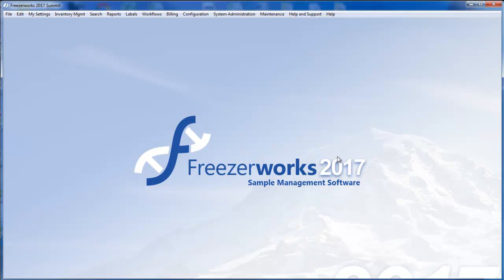Today we are going to go over configuring tests, which has received a pretty significant change. In previous versions, you could create quantitative tests and qualitative tests, but these were always separate. Now, there are just tests, where you can include as many quantitative and qualitative metrics as you'd like. Let's get started, shall we?